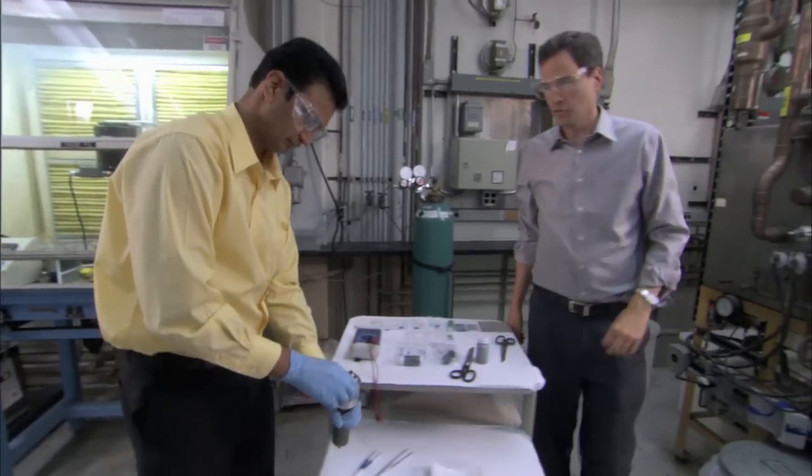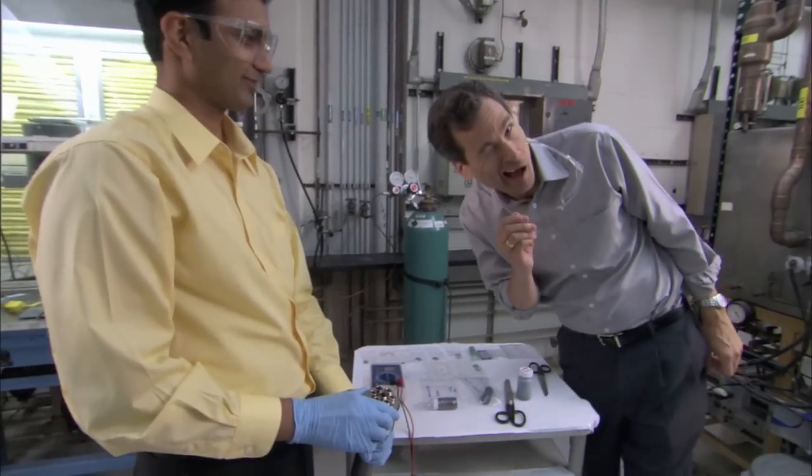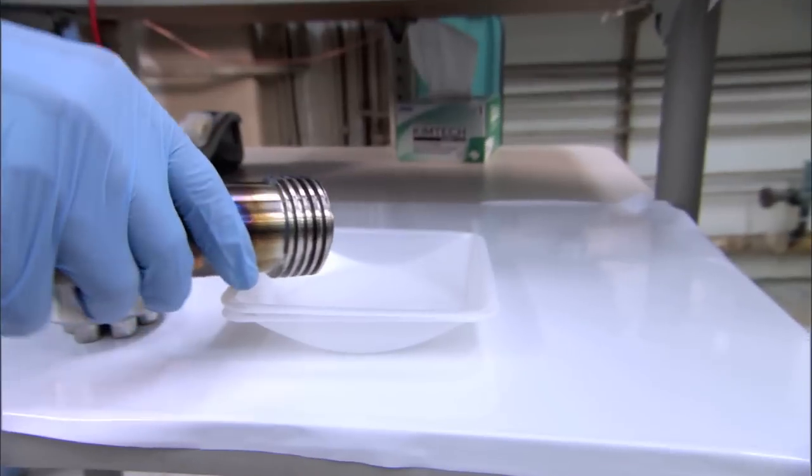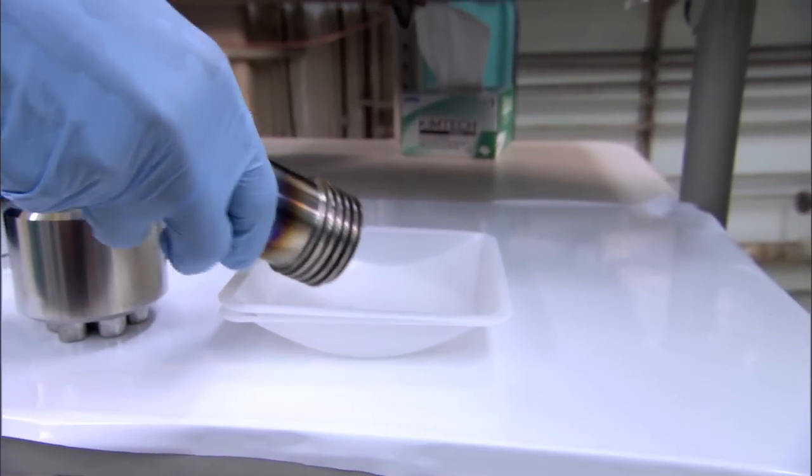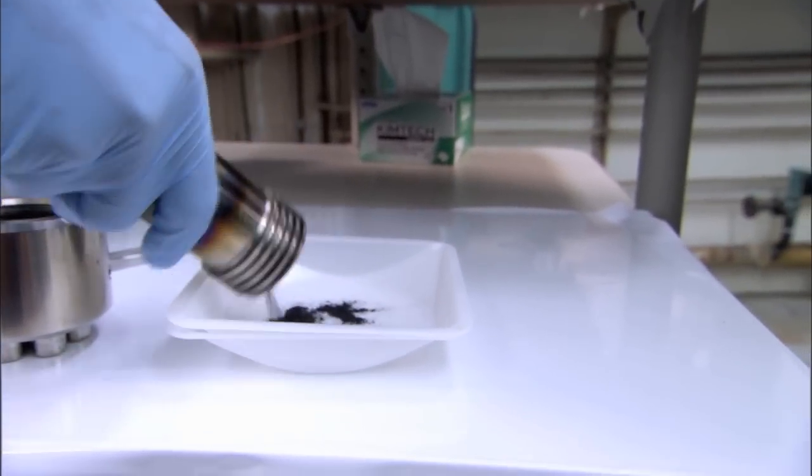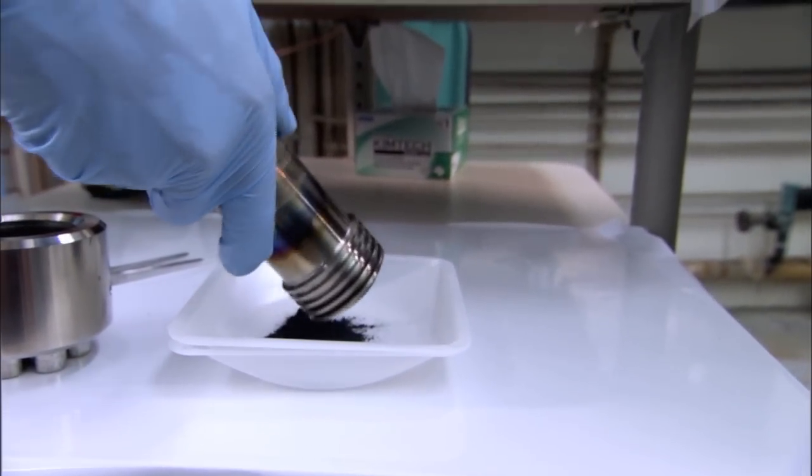Okay, so three hours have elapsed. And we're going to take a look at what you've cooked up. It looks a lot like black powder. But Vilas has another name for it.